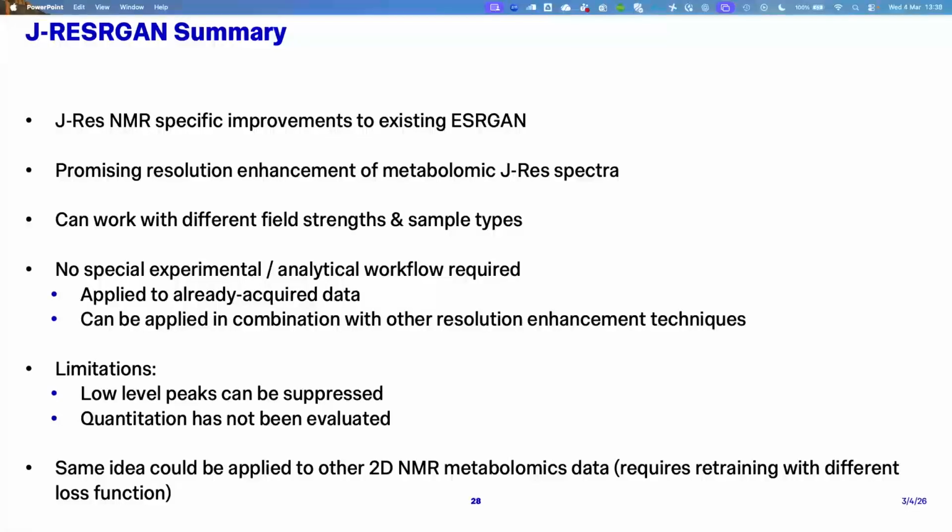There are various processing steps that can introduce artifacts themselves. So we had to do a few small tricks, but nothing crazy. For example, we ignore the very edge bands of the spectrum, where you do get more artifacts. So there are some changes, but essentially we're just trying to make sure that the generator will produce symmetric predictions. Any other questions at this stage?